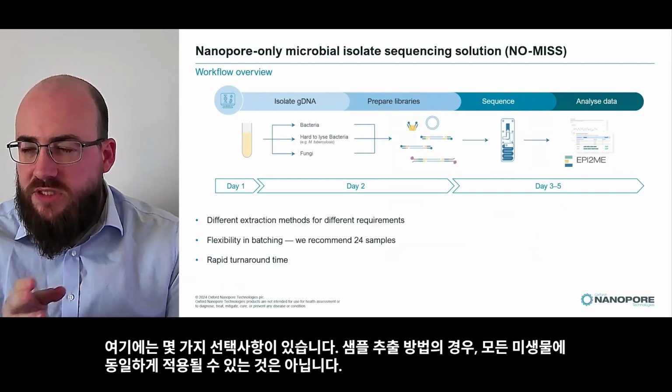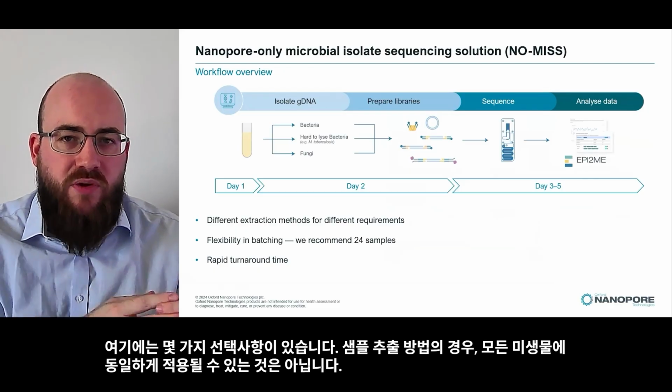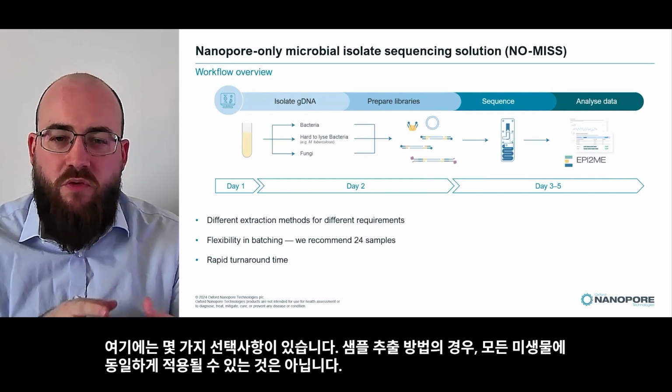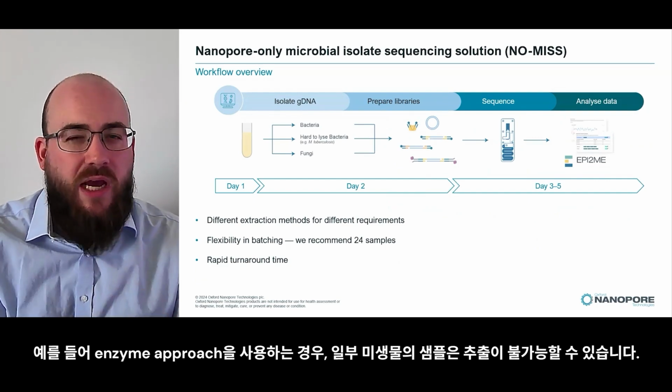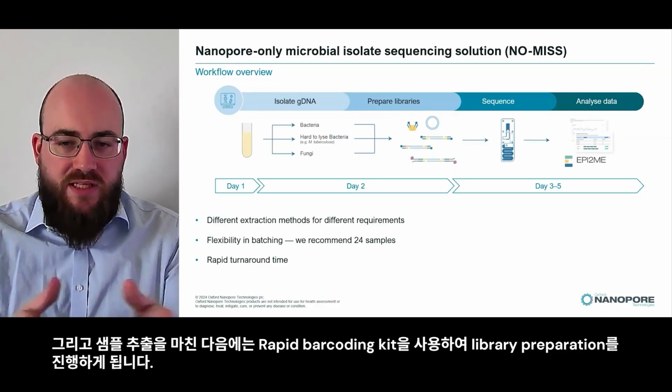We have a few options here for extractions. Not every extraction will be able to do every organism. Some are quite difficult if you're taking an enzymatic approach, and we'll run through that. But then after that, after you've done your extraction, it's all coming back together.